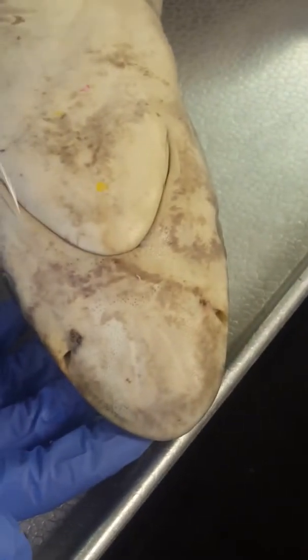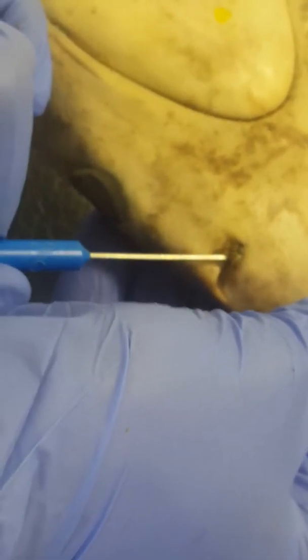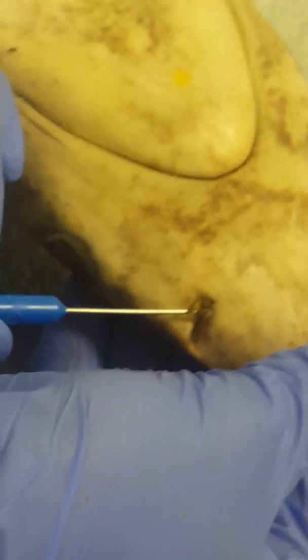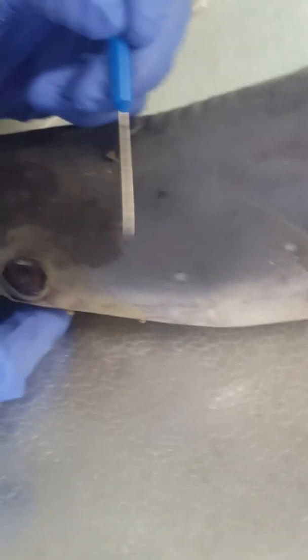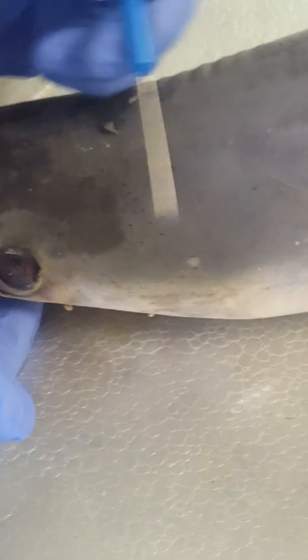Olfactory lamellae are located kind of underneath the nasal flap and the external aperture, tucked underneath — which is really hard to see. Spiracles should be located as a small opening kind of behind the eye in this area, but they aren't found on this shark.